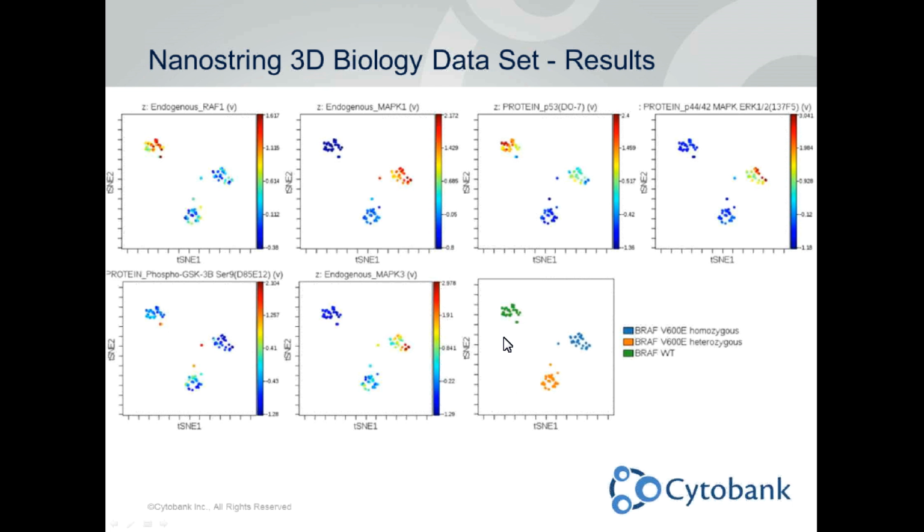And when you look at the key, again this annotation parameter, you can see that VISNE has separated these islands into their different sample types, or in this case, technically, the different genotypes: wild type, homozygous, and heterozygous for BRAF. In this case, DROP has allowed us to run VISNE on non-cytometry data to look at these differences across these different samples.